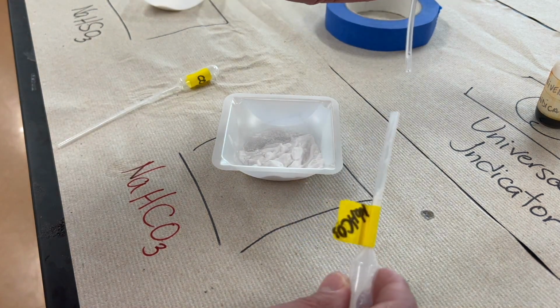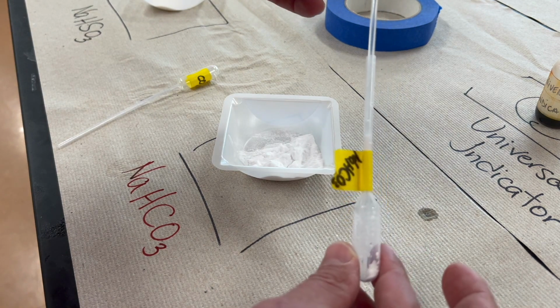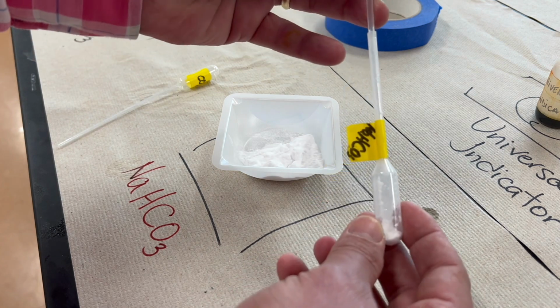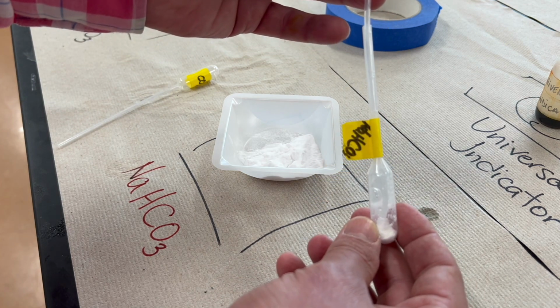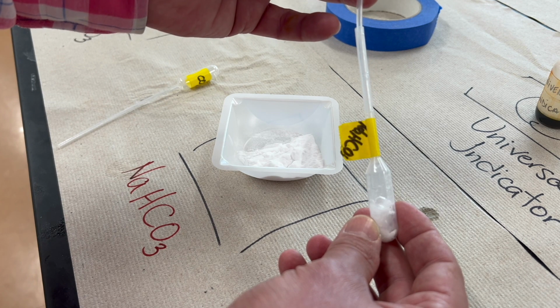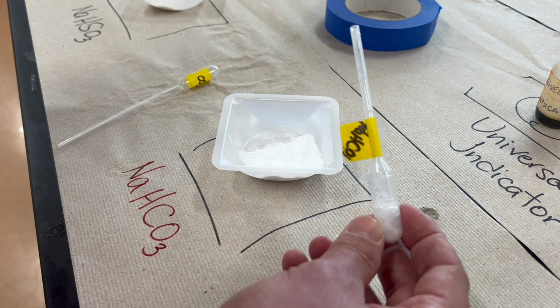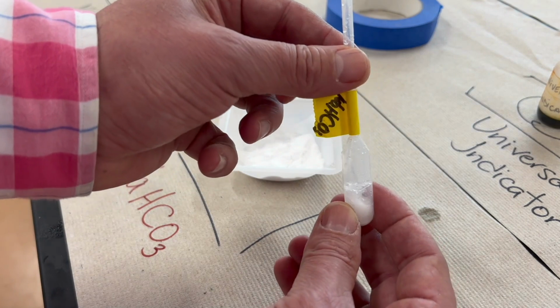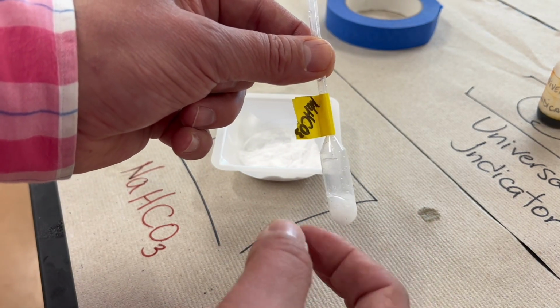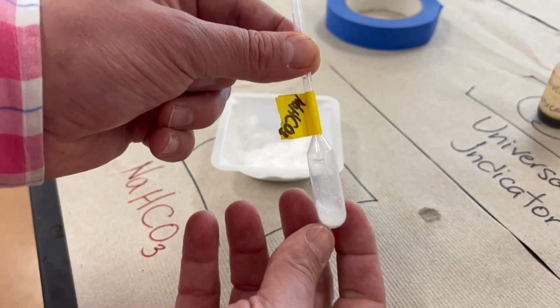Slide the hydrochloric acid pipette inside the sodium bicarbonate, go down, not completely down, and we're going to add about 10 drops, 20 drops. The reaction takes place, gas is being generated. So the gas has filled up the space right here.